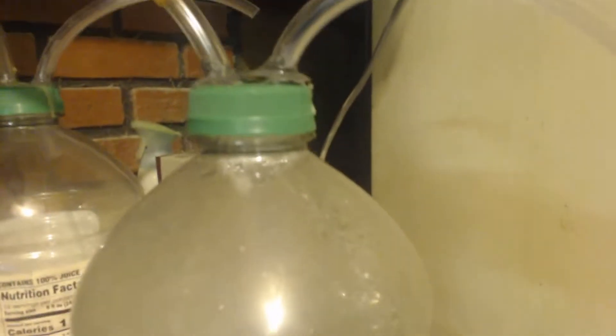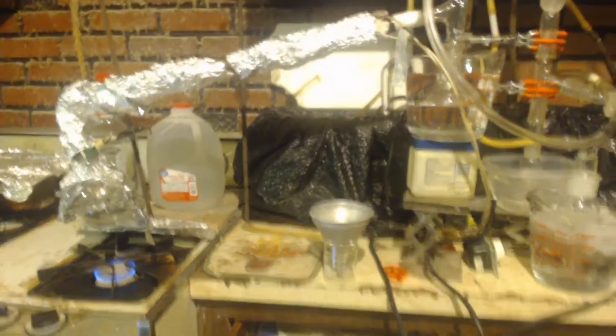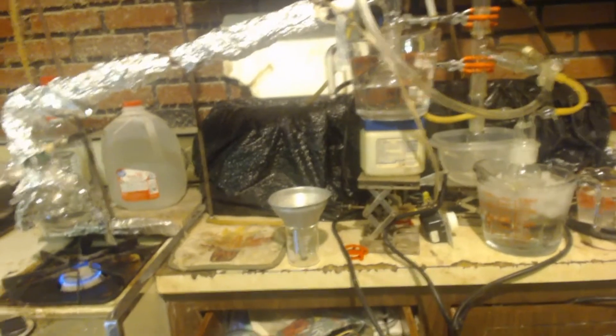It goes through the two condensers, and out through a hose that comes down into a suck-back trap — which is basically just empty — and then comes into another bubbler with about a gallon of water in it. It has two outlets on top that go to the outside, because I'm making hydrogen. I don't want the hydrogen exploding with flames or a static spark. I put the hose outside just to make sure.